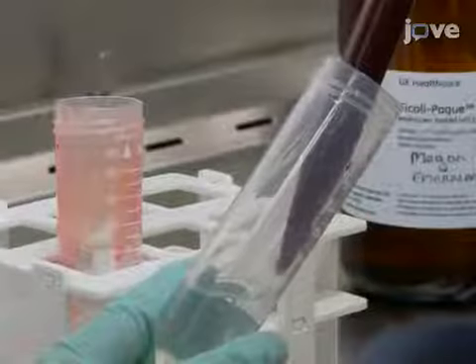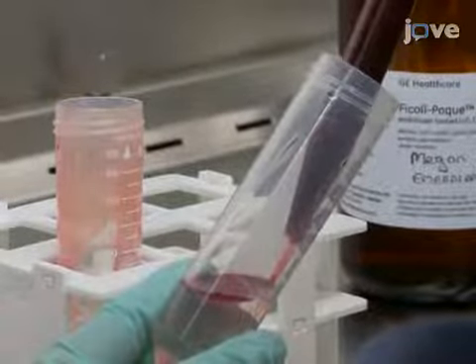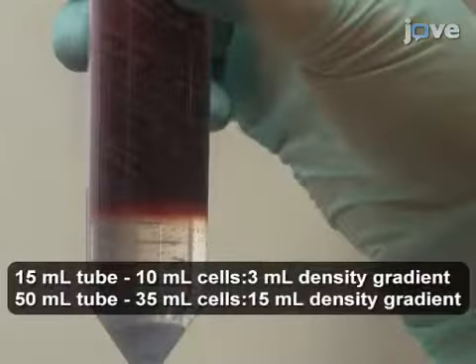Next, slowly pipette the blood cells down the side of a centrifuge tube onto room temperature density gradient, taking care not to mix the layers.